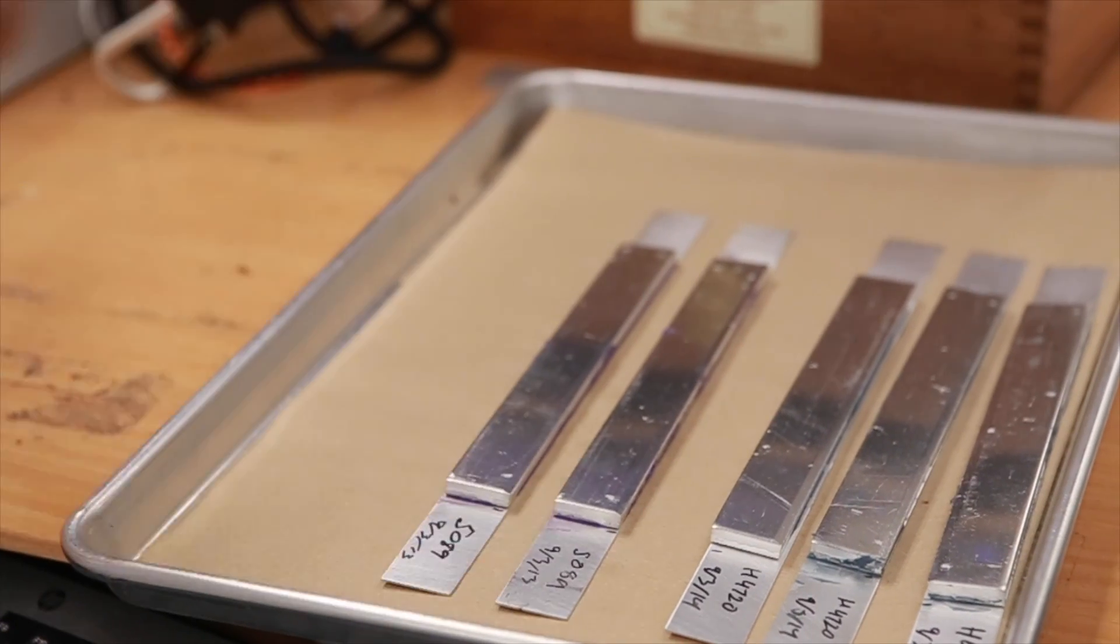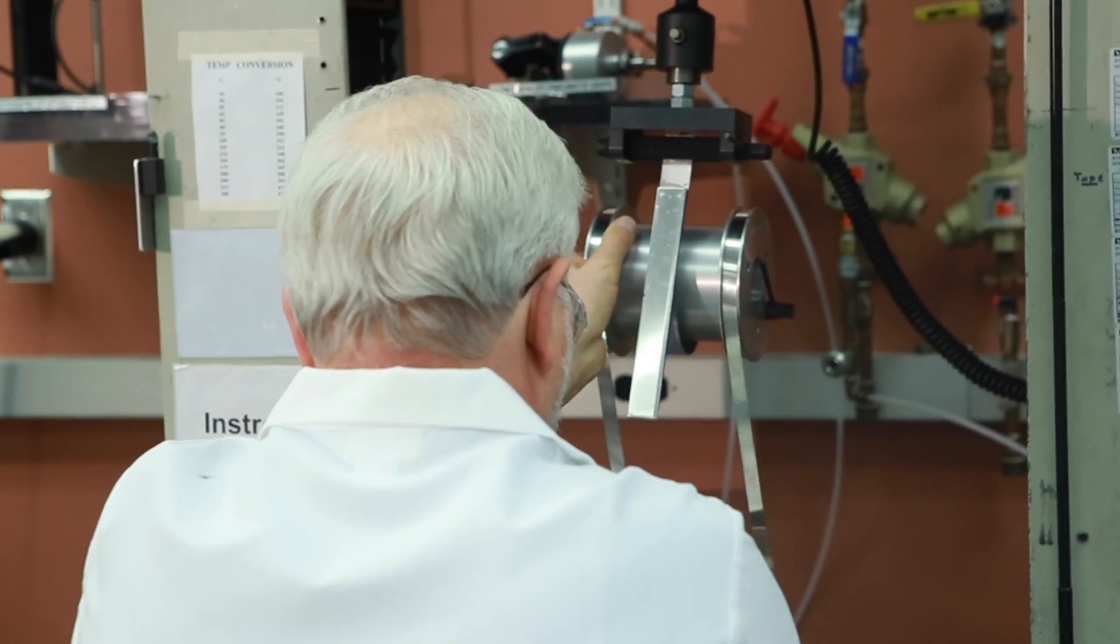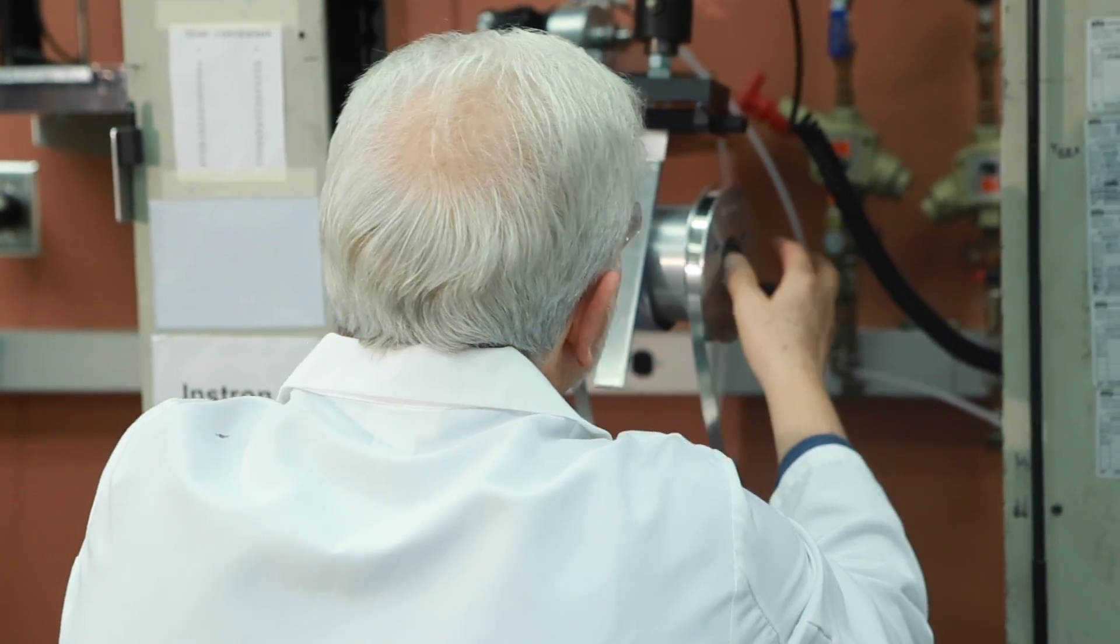Next we are going to test peel strength. Peel tests measure the average force required to fracture the adhesive bond between flexible materials when pulled at a specified angle. These tests are important for describing assemblies where the bond is subjected to peel loads.